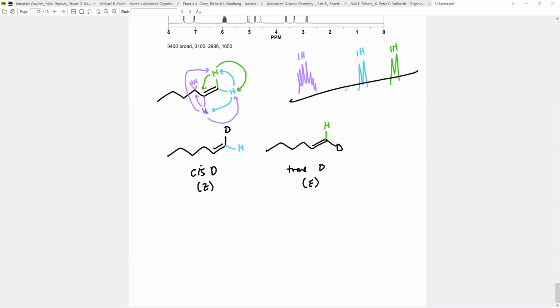And we tend to see this happen all across like 5 and 6. So I go like 5 and 6 like that. Okay. And obviously where they land is dependent on the system itself, but this is what we tend to see as a general pattern in the alkene region. Whether it goes up or down is going to depend on other effects as well. Okay, so this is a rough rule, right? If you see 2 doublets that are kind of low and then one multiplet that's kind of high, that's our indicator of these terminal alkene interactions.